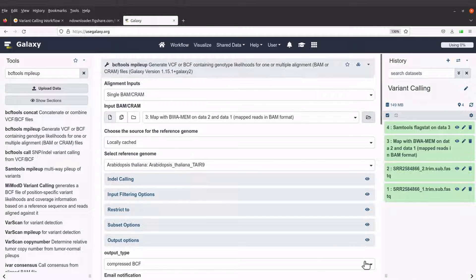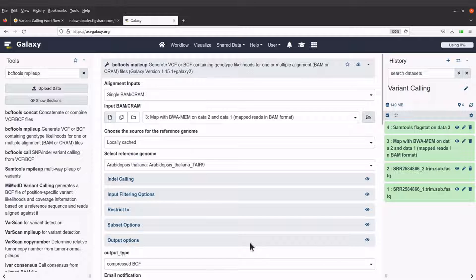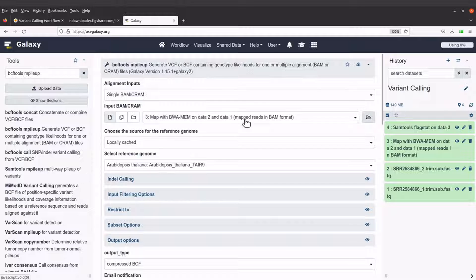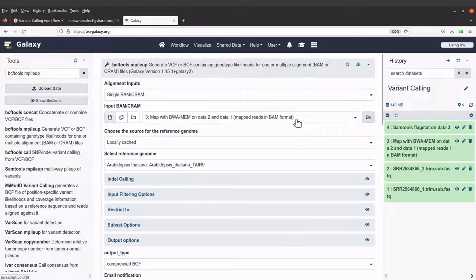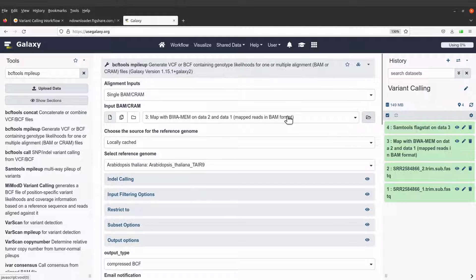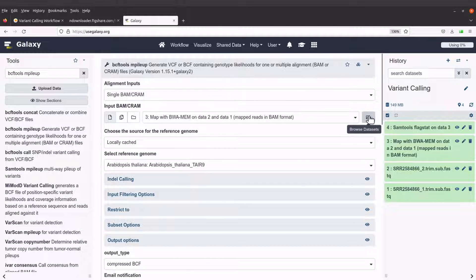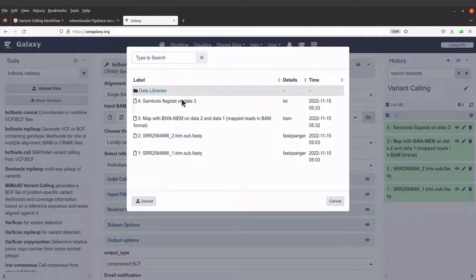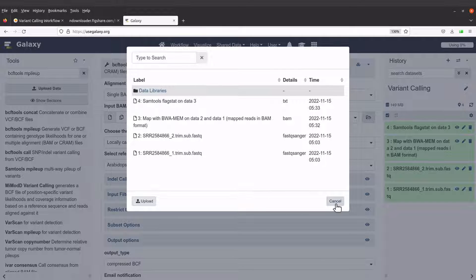Okay, so we have our bcftools mpileup tool ready. So we will specify our parameters here. We will start with the input file. We are going to use the one that was generated by BWA-MEM. So that's this one here. If you don't have it, just click on this browse dataset and select the appropriate file.